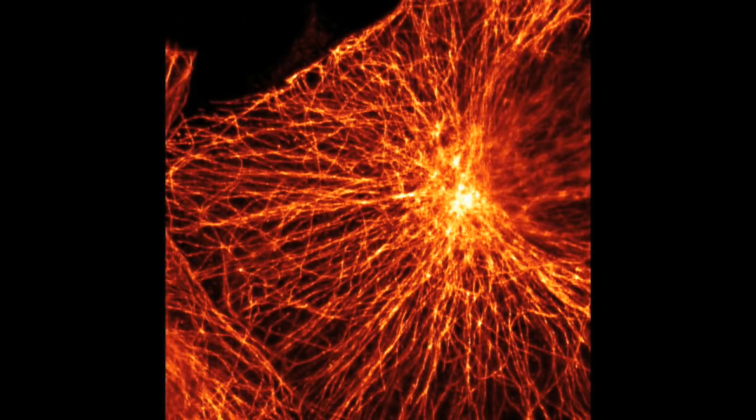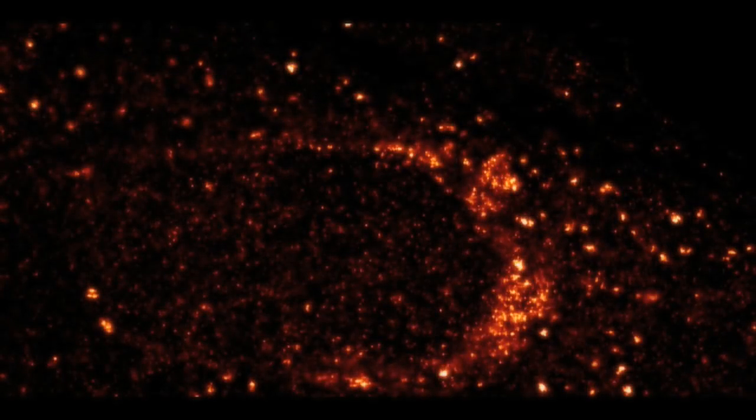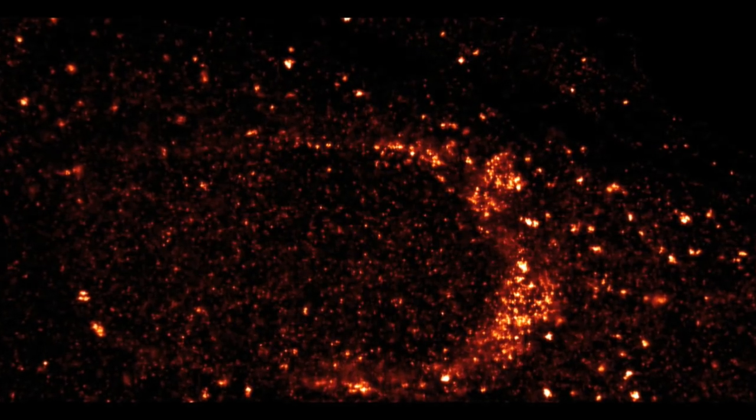This is how microscopes pictured a cytoskeleton previously. STED technology offers a much clearer view. An image of vesicles, containers for transmitters. STED turns it into a tiny cosmos.